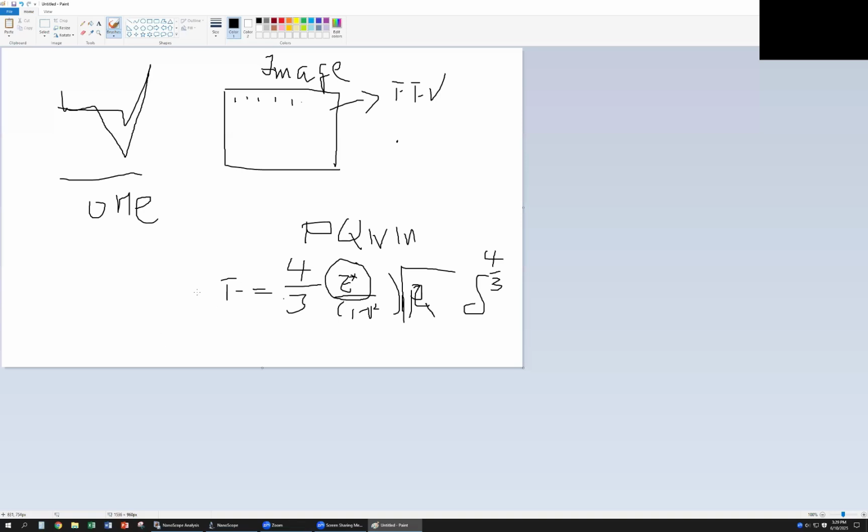So this is for F. We know from Hooke's law it is from the K and the X. Then from here is the force. This one is for deflection. This one we call the deflection. This deflection we measure on the AFM is from this detector, right? From this detector. That means we should know the force.